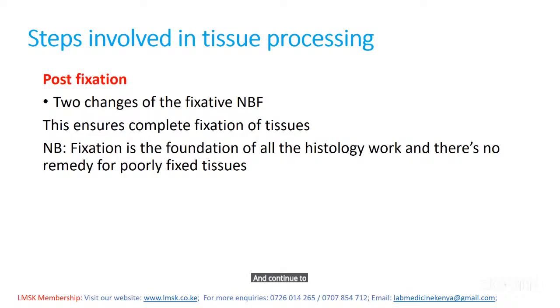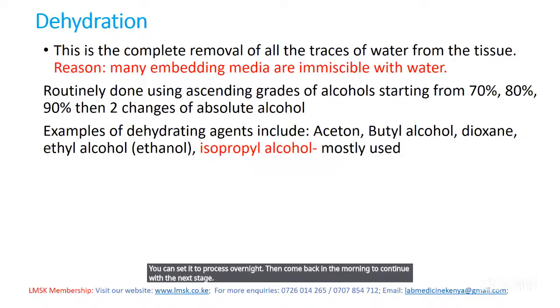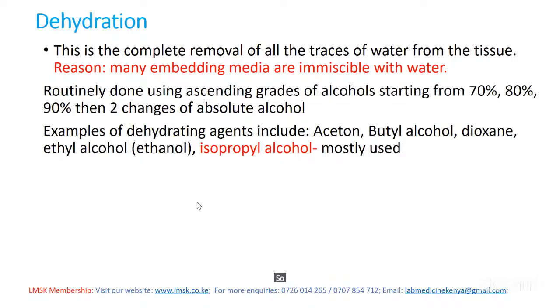For autoprocessors, of course, you don't need to be there. You can set it to process overnight, then come back in the morning to continue with the next stage. So as I've shown you in the tissue processor, after fixation, we go to dehydration.